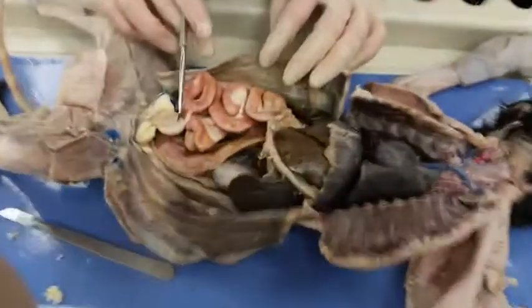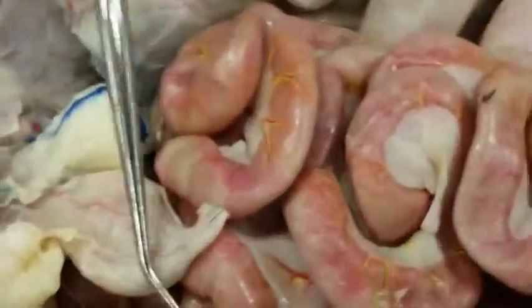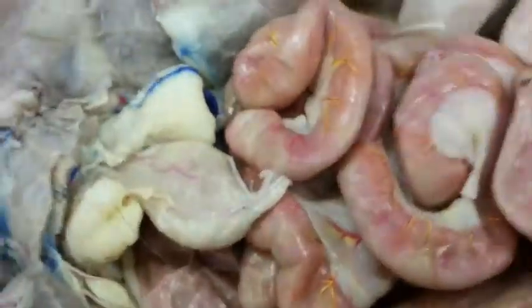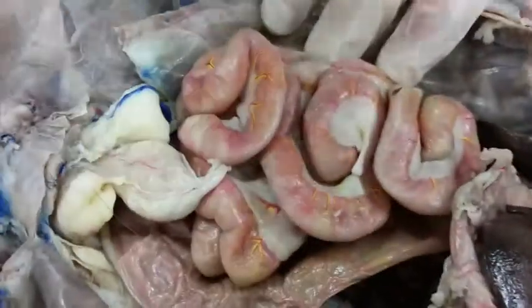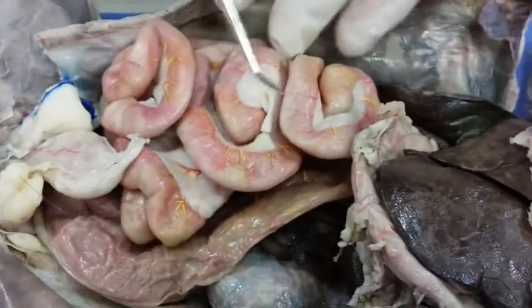Alright, welcome to the inside of Halle Berry. We have the urinary bladder. There should be a crap ton of what looks like fat, but is not actually fat, but all around here there should be greater omentum. We accidentally dissected that out, so that's that.